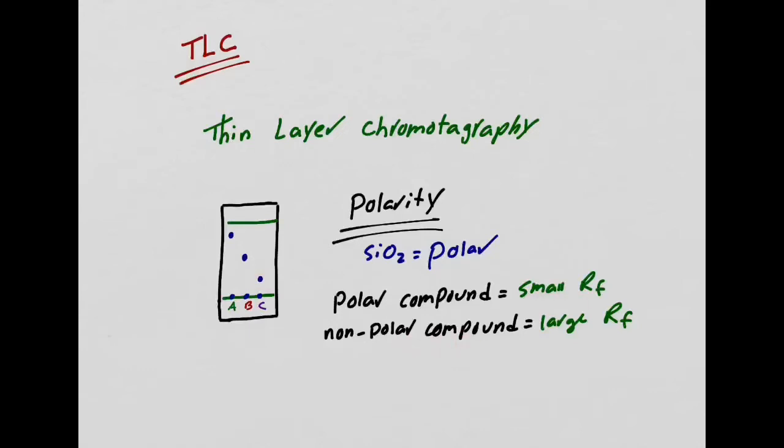Now, if you have a non-polar compound, it's not going to like the polar plate, so it's not going to interact much. It's just going to whoosh, go up as fast as it can. So it would have a large RF value.